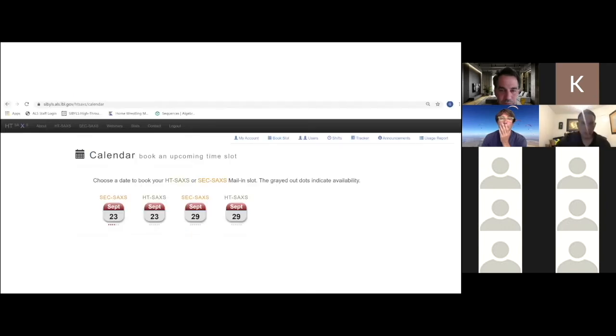So Catherine's been through this with you guys. She's shown you how to click time and access the sample. The hope is that from the conception of your experiment to collection, it should be like 2 weeks. So we're trying to really make SAXS data collection available to all very quickly in High-Throughput. She's gone through that.